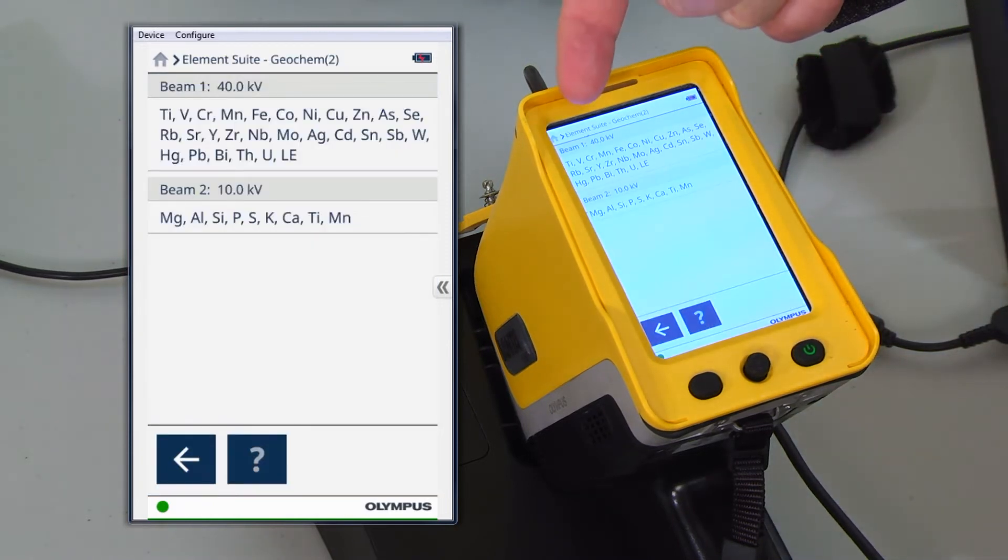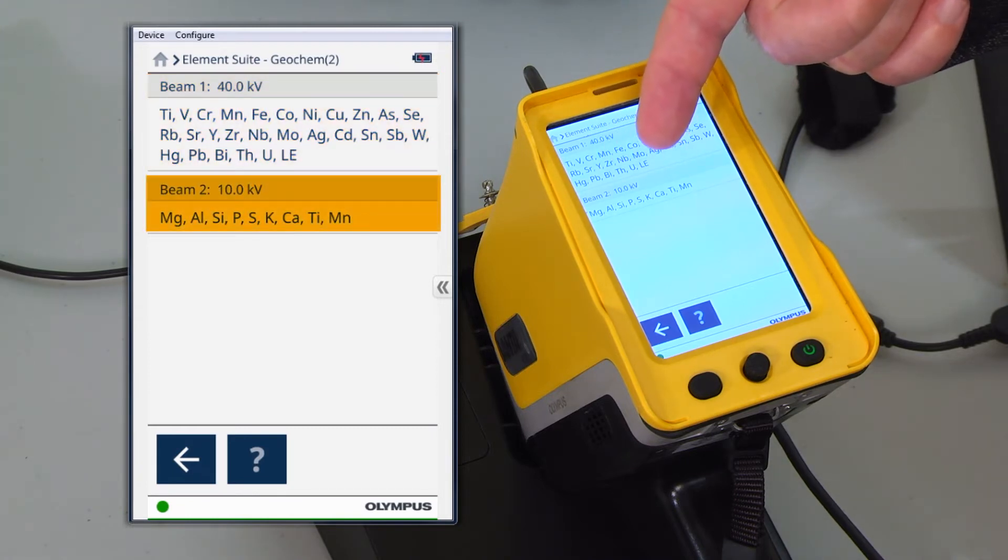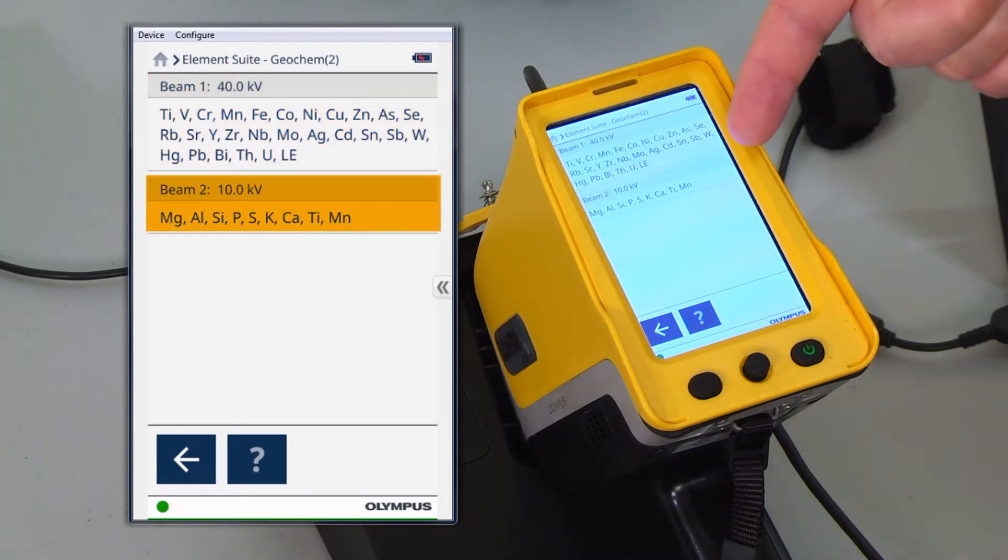And here's where we have the information for this Geochem two-beam setup. Beam one's measuring at 40 kilovolts. It's optimised for those elements. Beam two's running at 10 kV and is optimised for these elements.